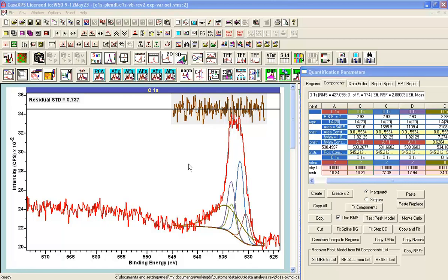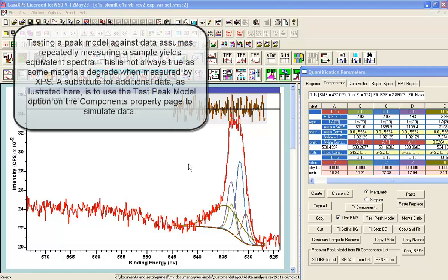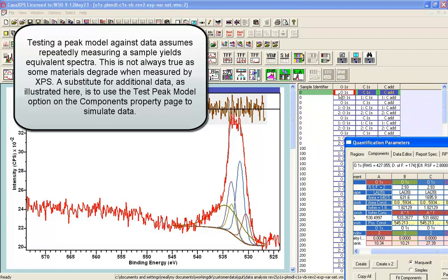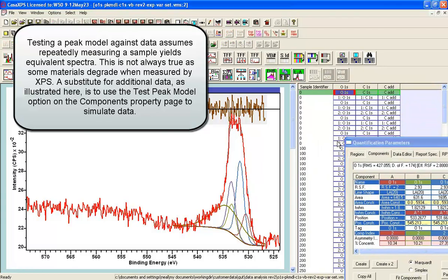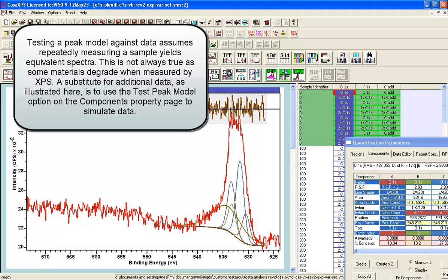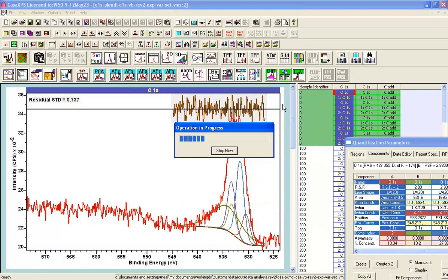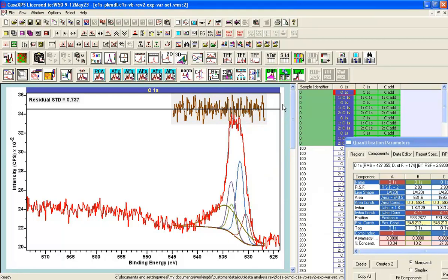The question now is: have we achieved a good peak model? The way we can test this is to use the fact that the spectrum I'm working on is one of a set of spectra measured from the same sample under the same conditions. If I propagate this peak model to these other spectra and fit it, and we get a consistent answer, that might suggest we're along the right track.